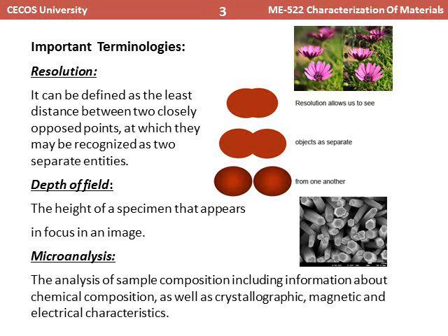I hope you understand this topic right now. If you have confusion, then definitely in the later lectures, when we discuss SEM in more detail, you will understand what I mean by depth of field. But in principle, you have to remember that by normal SEM, we can visualize only the surface of an object or a specimen. If we want to see the specimen surface in detail, then we can see the surface using scanning electron microscopy. But we cannot see how much the height of this object is.